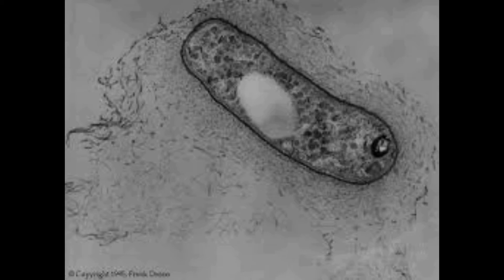Under microscope, we can see the rhizobium bacteria. Rhizobium is a gram-negative soil bacteria that fixes atmospheric nitrogen.